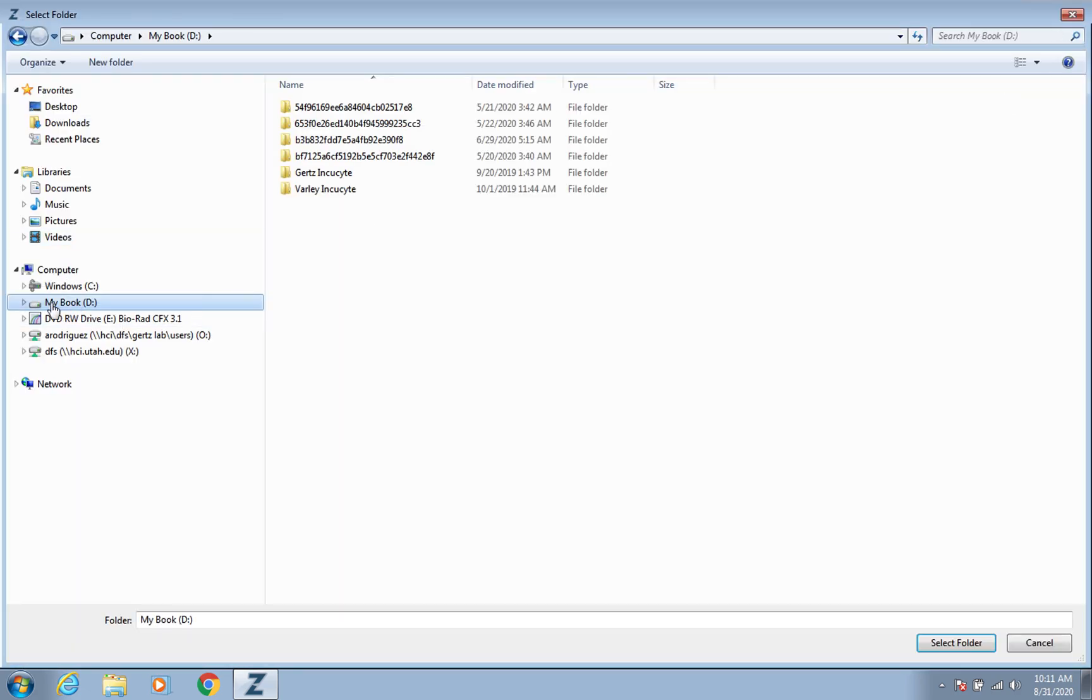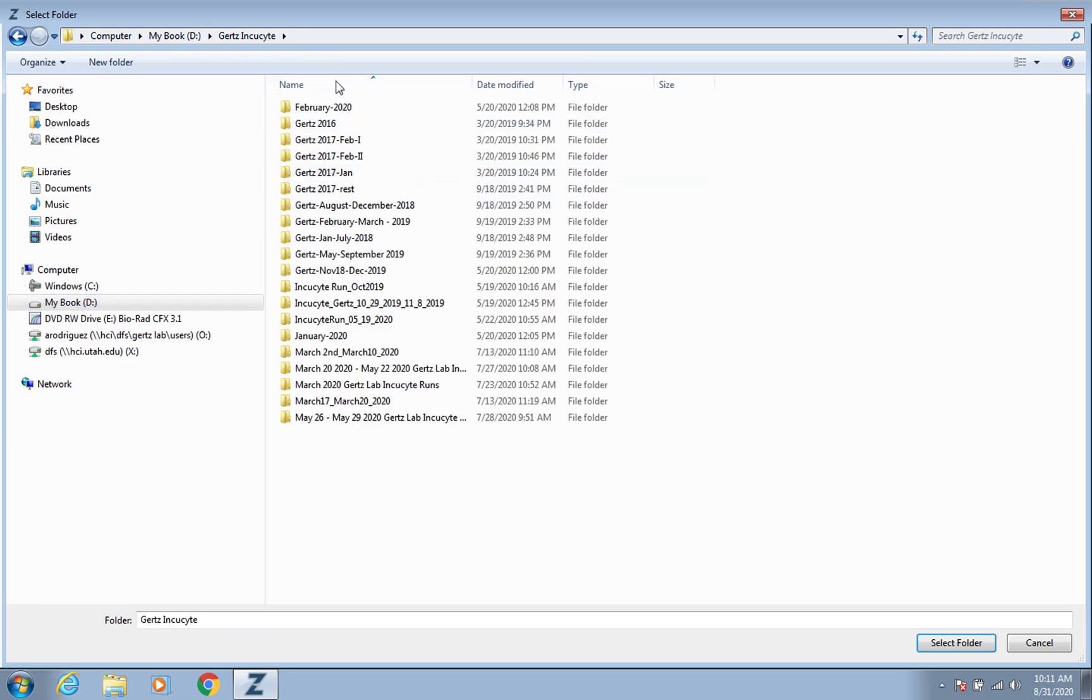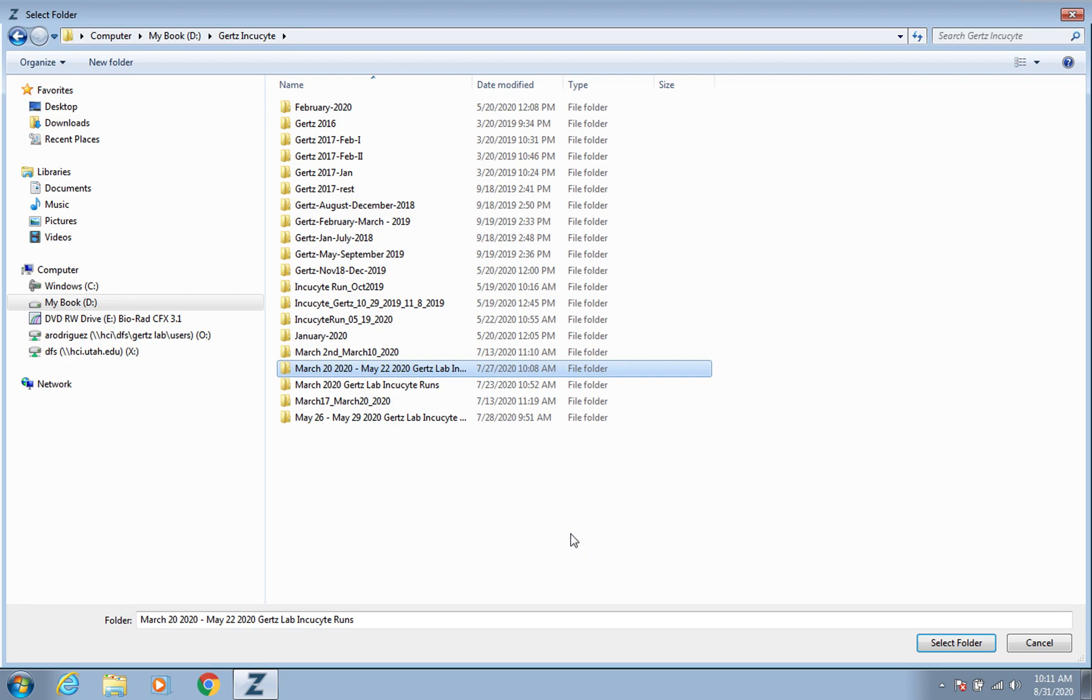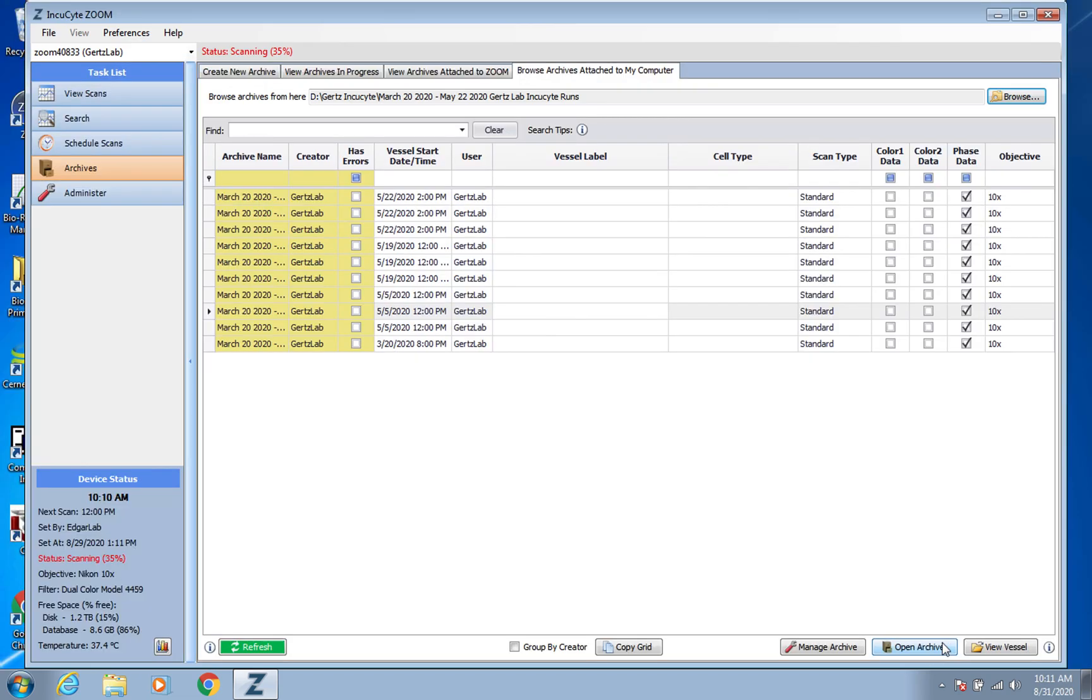You want to click our external hard drive, go into the Gertz Enki site, and now pick whichever one. Make sure you single click it, don't double click it. You want all the folders that are within this folder. So you need to just single click it and then go down and actually press select folder.